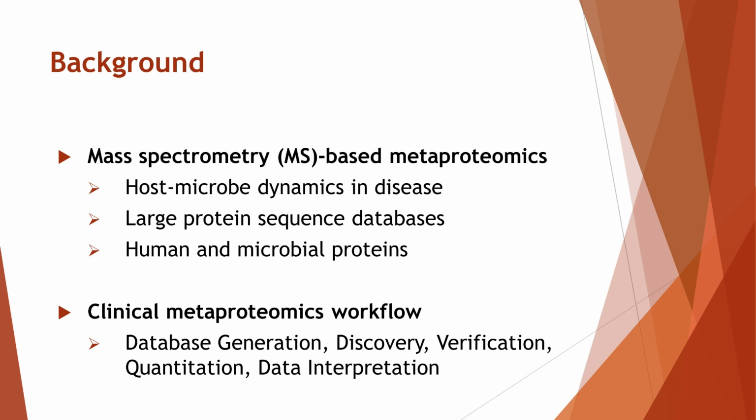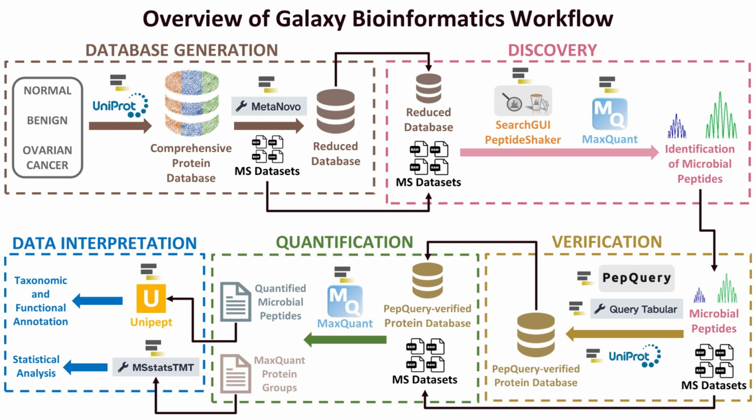So, moving on, this tutorial is broken down into 5 modules: database generation, discovery, verification, quantification, and data interpretation, which I will cover on the next slide. This is an overview of the entire clinical metaproteomics tutorial.